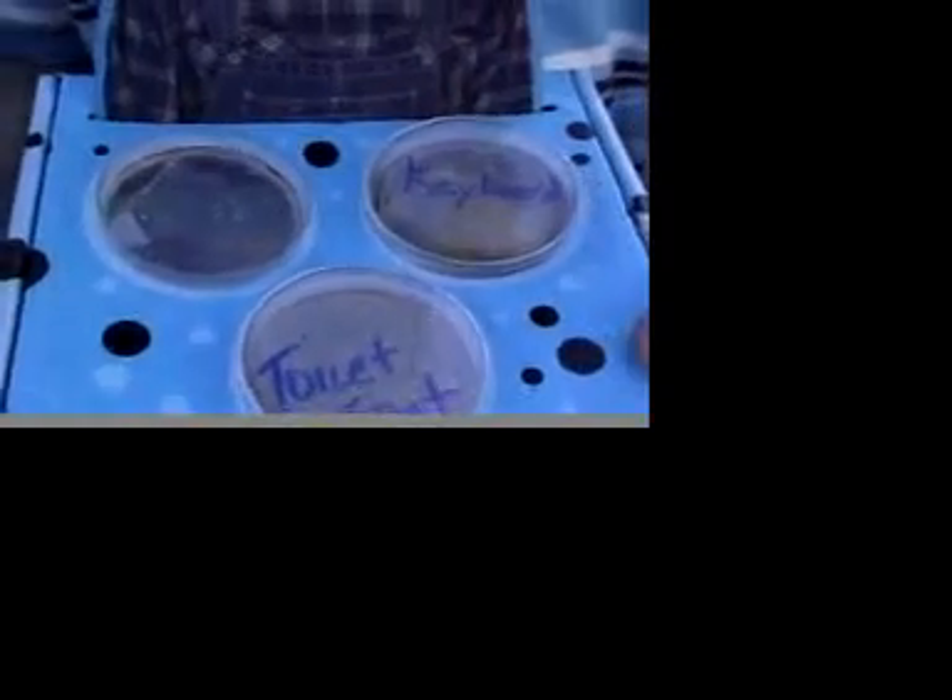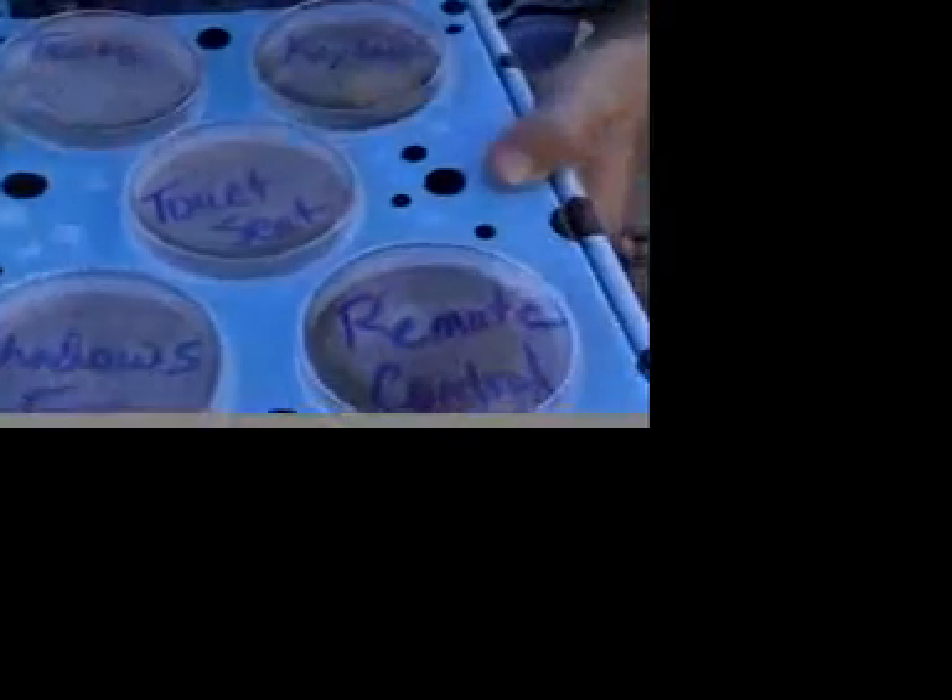The teeth — they don't look too bad. And the toilet seat, that doesn't look too bad either. And there's my dog's fur — there's a little bit there.